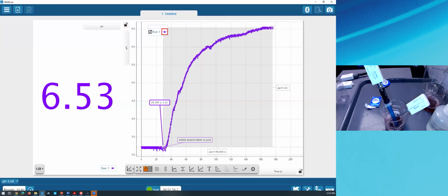All right. Christian talked about doing experiments with students about maybe changing the temperature of the juice. In that case, you might be interested in time. How long did it take for it to stabilize? Does that change with the temperature? And questions like that. So the delta tool is a great way to figure out changes from point to point. And again, it's hidden inside the coordinates tool. So click on the coordinates tool label, and you'll see that delta symbol.